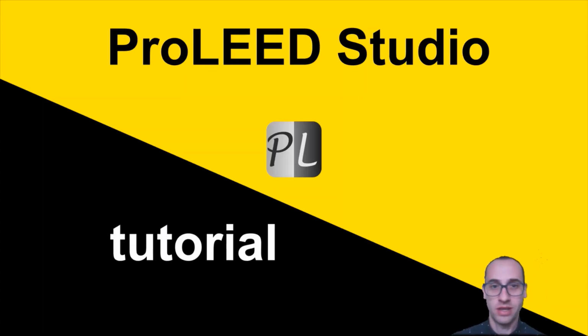Hello everyone and welcome to the ProLEED Studio tutorial. Here I will show you ProLEED Studio software, which I specifically created for simple and intuitive modeling of low energy electron diffraction patterns. It was actually done by an experimentalist for experimentalists to make our life much easier.